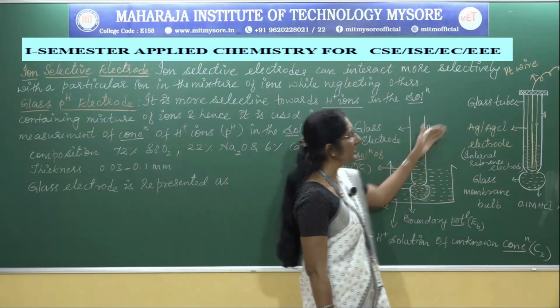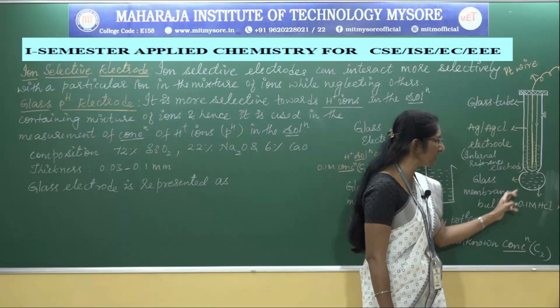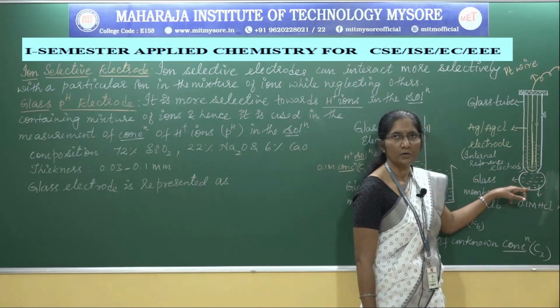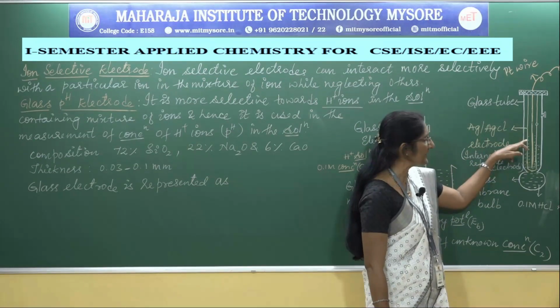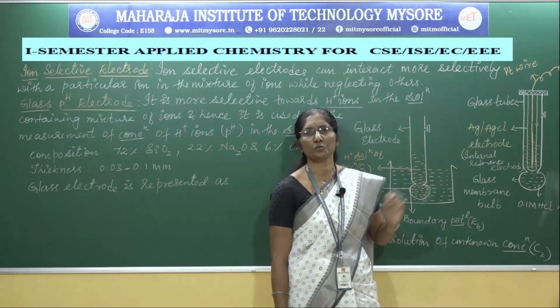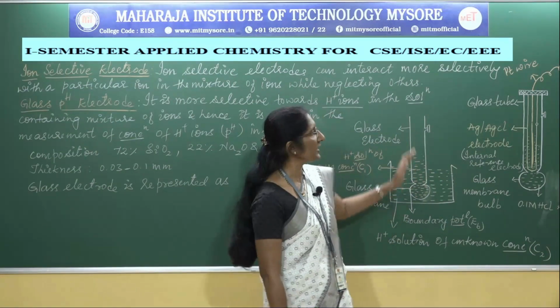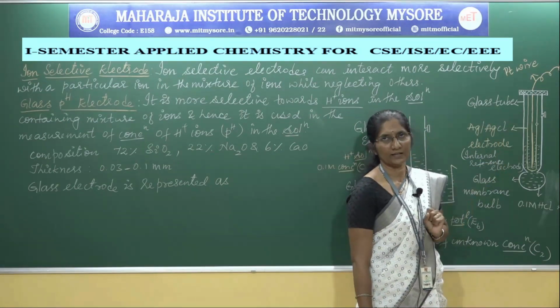To summarize, the glass pH electrode consists of a long glass tube having a small glass membrane bulb at the bottom, and a silver chloride electrode is inserted in it. This electrode acts as an internal reference electrode, is used to measure the boundary potential, and is also used to connect this electrode with other electrodes.